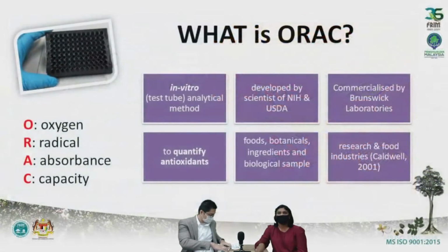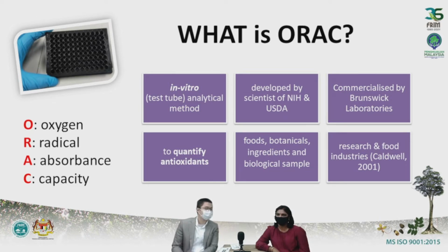Firstly, what is ORAC? ORAC stands for Oxygen Radical Absorbance Capacity. This is an in vitro analytical method which was developed by the scientists of the National Institutes of Health and also USDA, and it was later commercialized by Brunswick Laboratory. We use the ORAC assay to quantify antioxidants in foods, botanicals, ingredients, and also biological samples. And the ORAC assay is very popular among the research and food industries.